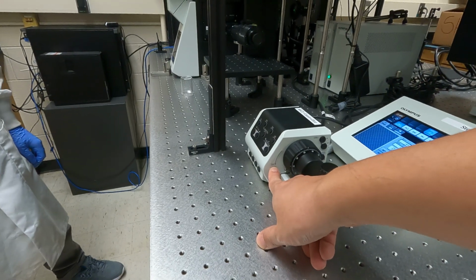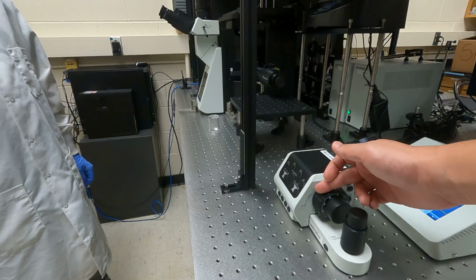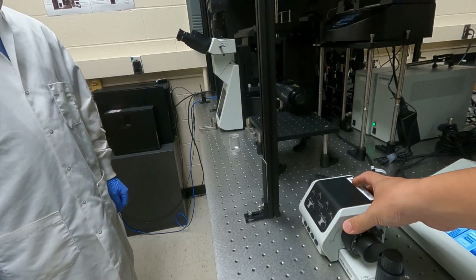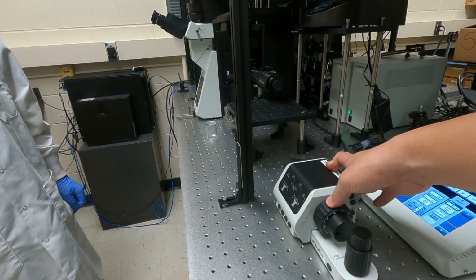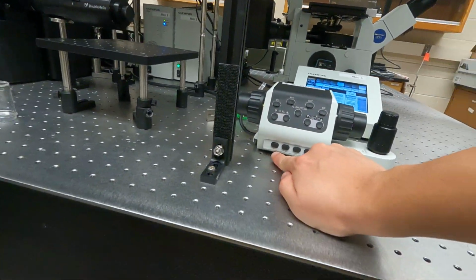The direction is indicated on the side of this controller. So if you rotate it in this direction, the objective moves up. If you rotate it in the clockwise direction, it will go down. There are a bunch of these buttons at the bottom as well.